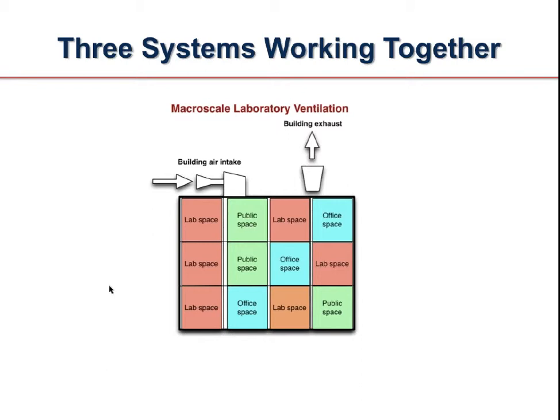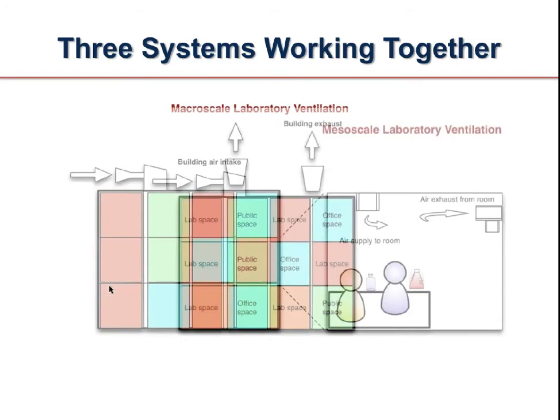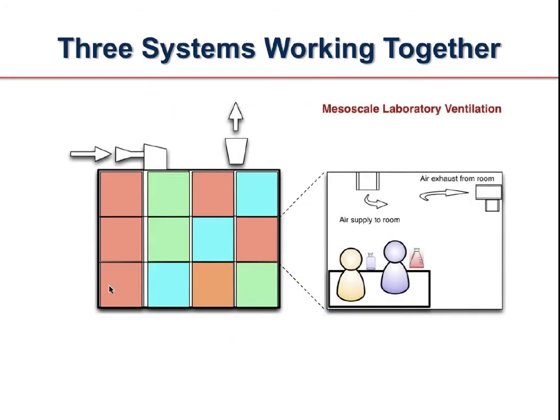And then we also have the air handlers, exhaust fans, variable speed drives, all those building components that need special expertise that, frankly, I don't have. I'm a lab person, but I need those people that do. That's the design people, the operational people, controls technicians, and the maintenance personnel who understand those systems outside of the room. And then this is where people like Ralph and I come in.